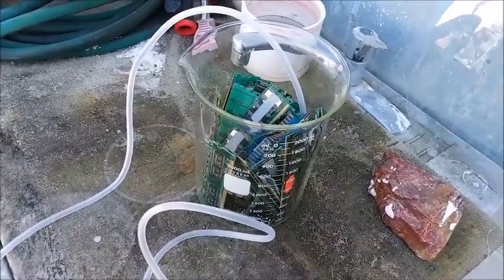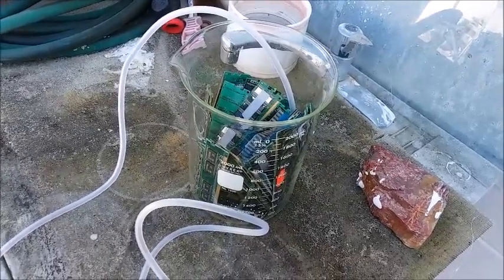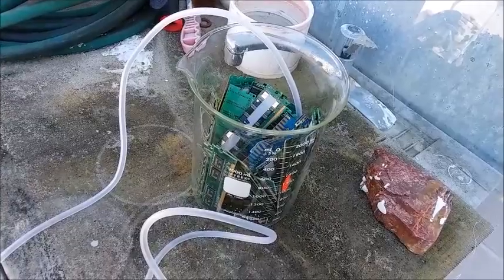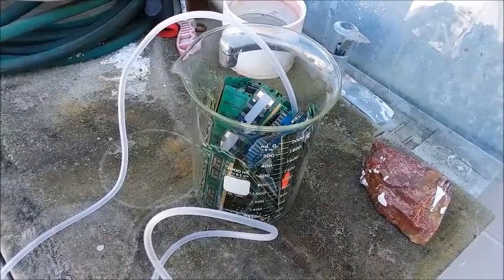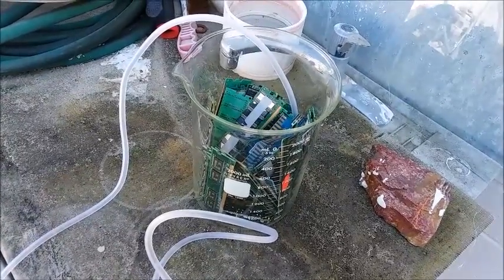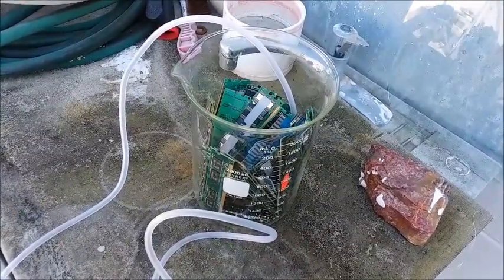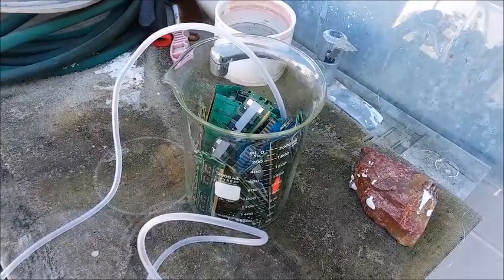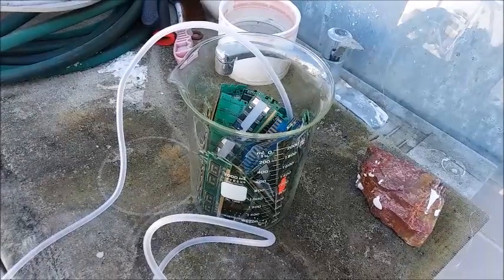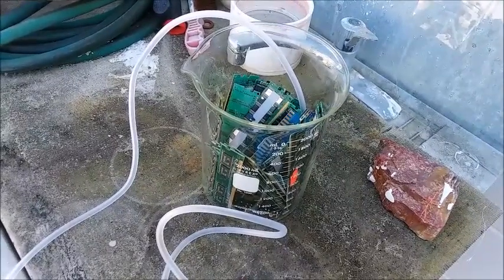I'm going to use the same mix of chemicals as the first time: 30% hydrochloric acid and 3% hydrogen peroxide. They're dirt cheap - I already use the acid for my pool and for cleaning. Hydrogen peroxide is dirt cheap too. I don't want to spend more money on chemicals than I'm going to make from the gold. Some sites say you don't even really need the hydrogen peroxide and that air bubbling through will work eventually, but I've got it so I'm going to use it.